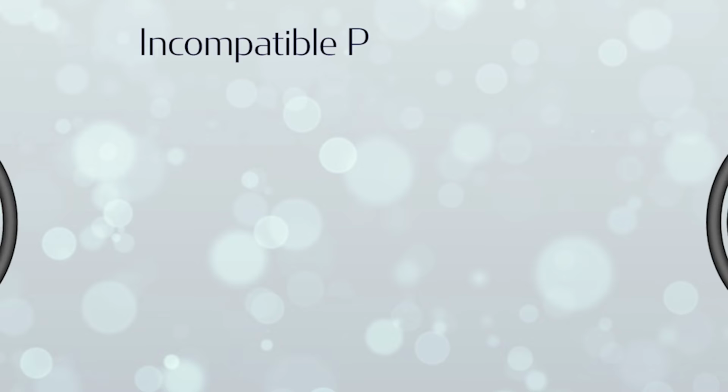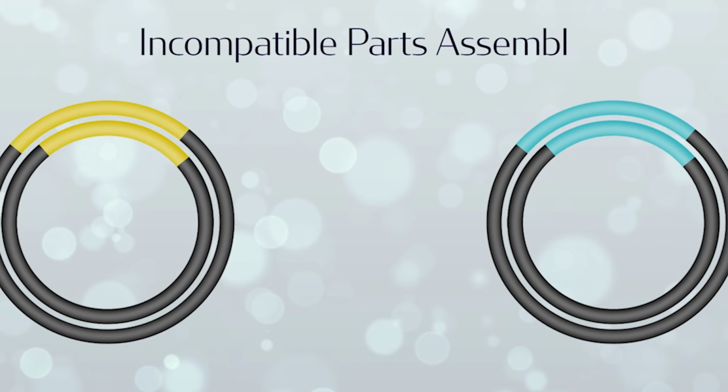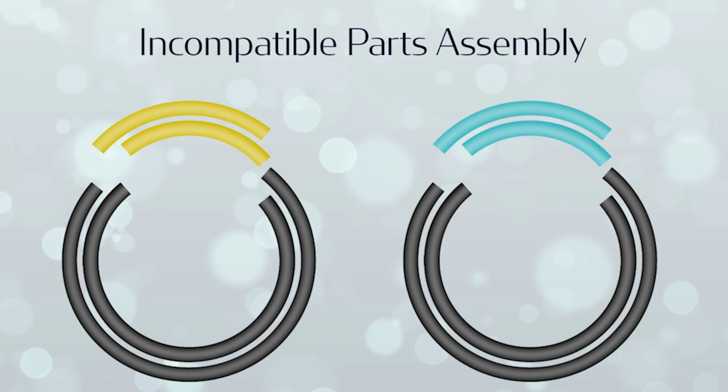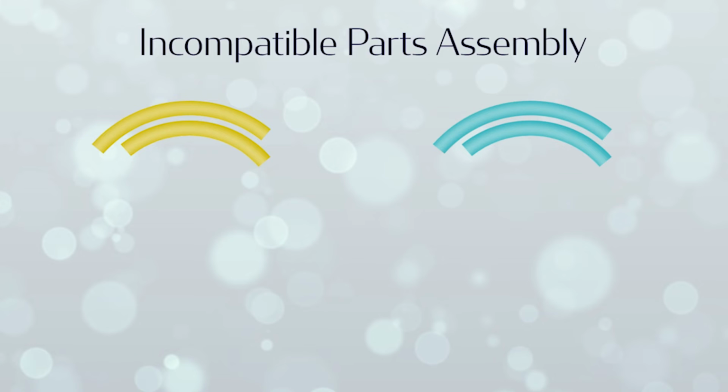In an extension of clone conversion, oligo stitching can also be used for directly assembling incompatible parts. The first step of this process is again the restriction enzyme digest. 1 acceptor and multiple donor plasmids are digested with the right restriction enzymes, resulting in the desired backbone and Golden Gate parts. The second step is the Gibson assembly.